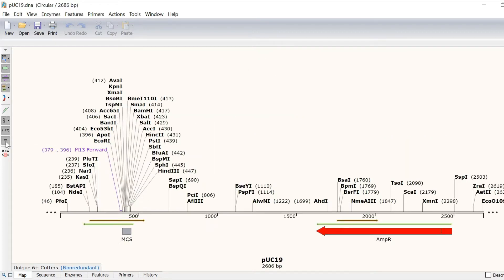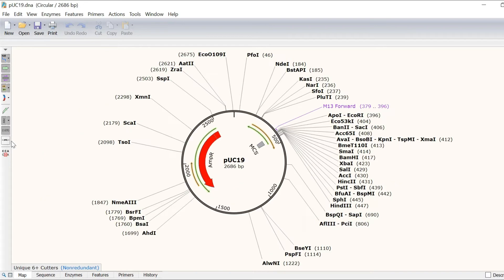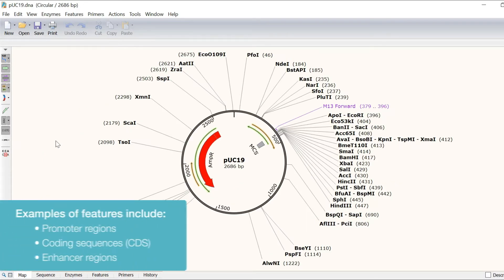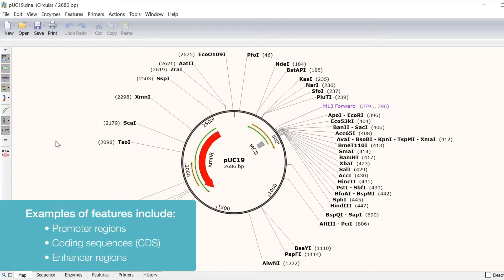You can easily annotate open reading frames or sequences of interest by creating a feature. By default, Snapgene automatically annotates features when creating or importing a new sequence.